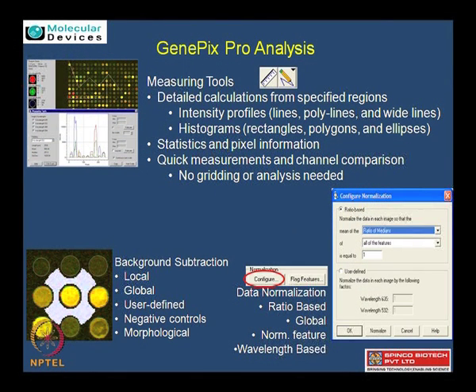Sure. So in the result tab, immediately what you see is a window which lets you configure different types of normalizations. There are different kinds of background subtraction one can perform. As you see in the image, if this is my spot in the yellow, which has a periphery ending in black, the surrounding areas which are surrounded by white can be used to calculate the local background correction. The local background correction is immediately near the feature, an area which should not have any fluorescence coming in, and whatever does come in is just because of the background. That is called the local background.